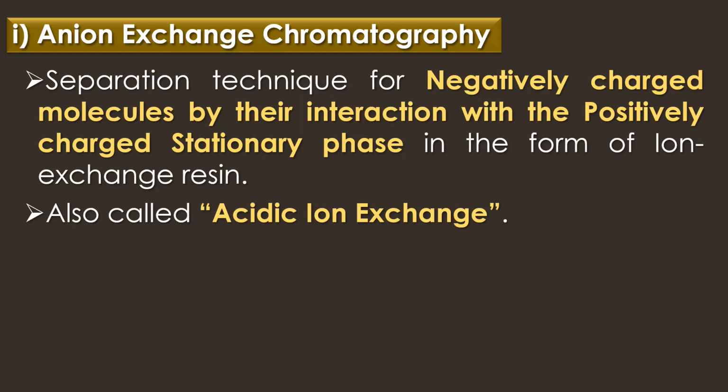The first type is anion exchange chromatography. Anion exchange chromatography is the separation technique for negatively charged molecules by their interaction with the positively charged stationary phase in the form of ion exchange resins. It is also called acidic ion exchange.